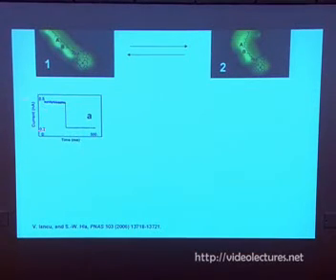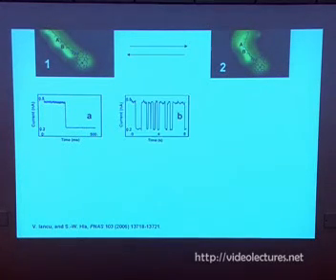So this is the time, this is the current. So we can measure the rate of switching here. If we keep the tip longer, we see this kind of digitized signal switching back and forth between these two. And we can change this frequency by increasing or reducing the current. So we can relatively control the frequency as well.